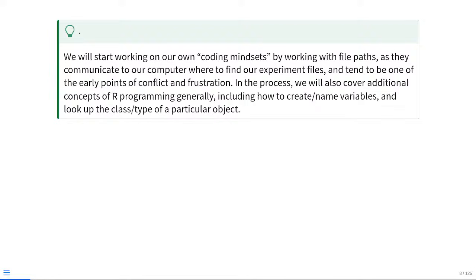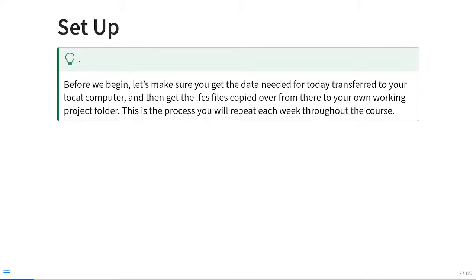So this would be stuff that, if you're taking a more traditional basic R course, would go on and on about types of objects for a couple of weeks in a row. I'm going to try to make this a little more interactive, but you still need some of this basic knowledge. It will be helpful later today when we're working with file paths, as far as being able to assign one to a particular object and then bring back in those particular file names later on.